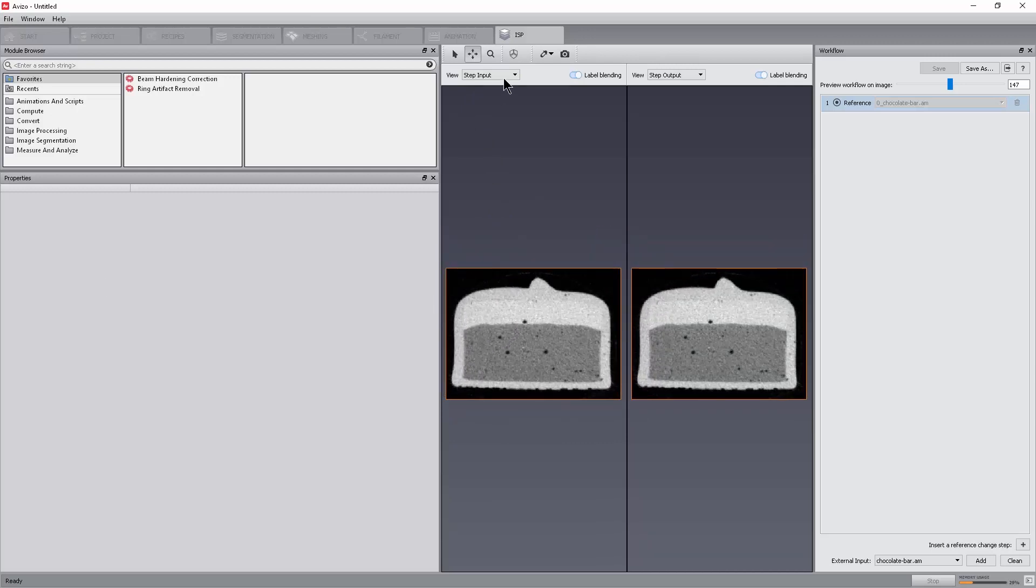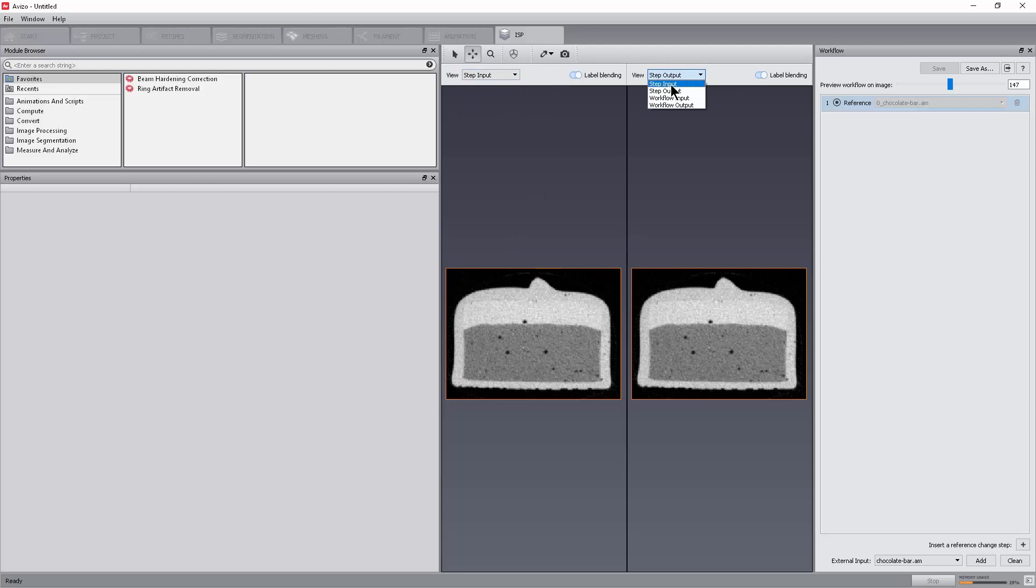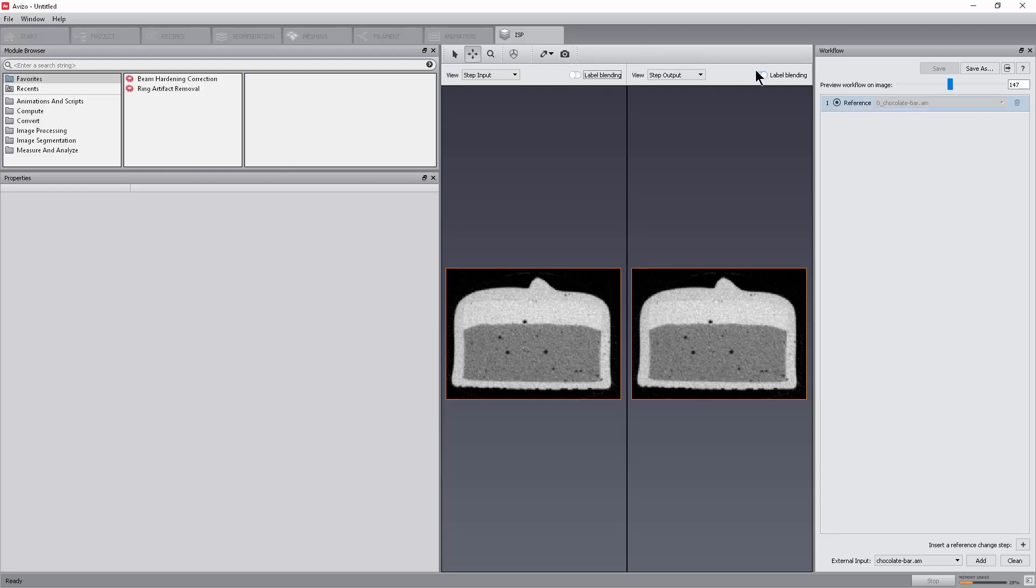The Viewer mode can be changed with the View Combo Box. Any view can be set up with the Step Input, default of the left viewer, the Step Output, default of the right viewer, the Workflow Input or the Workflow Output. By default, when the output of a Step is a binary or a Label image, it is automatically blended with the last greyscale image of the stack.